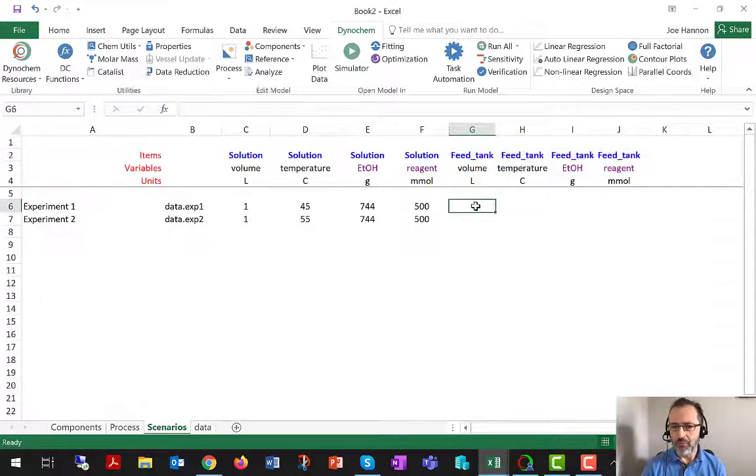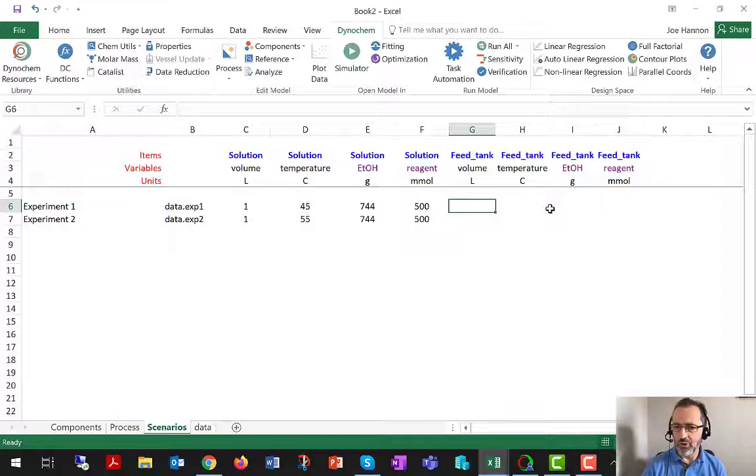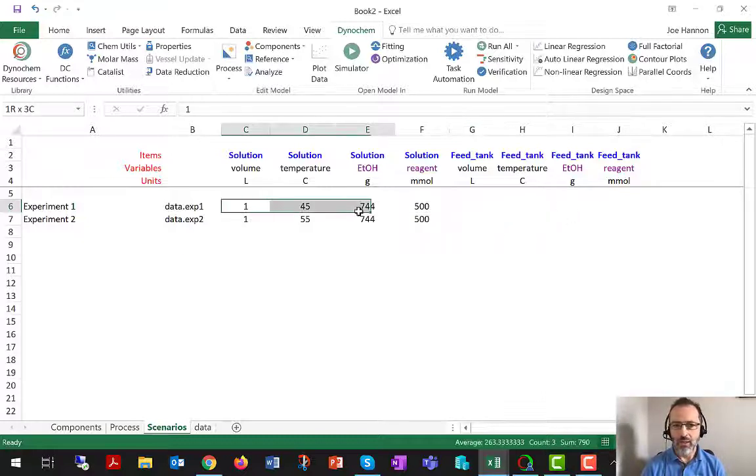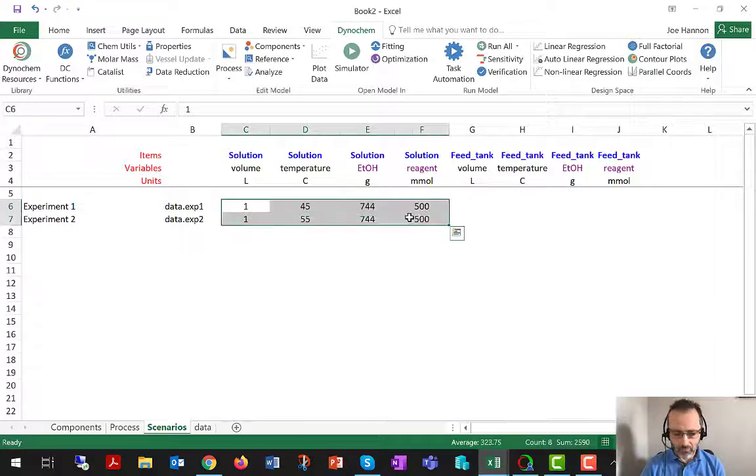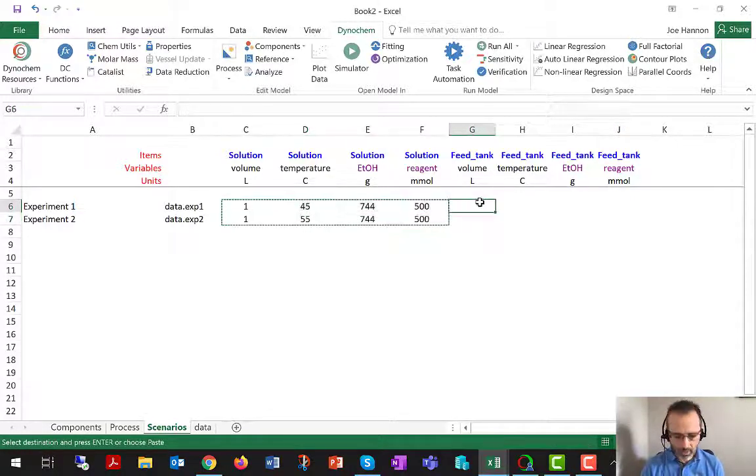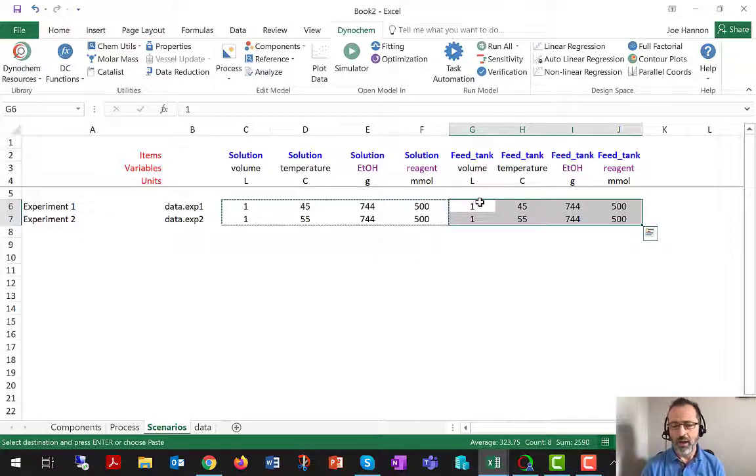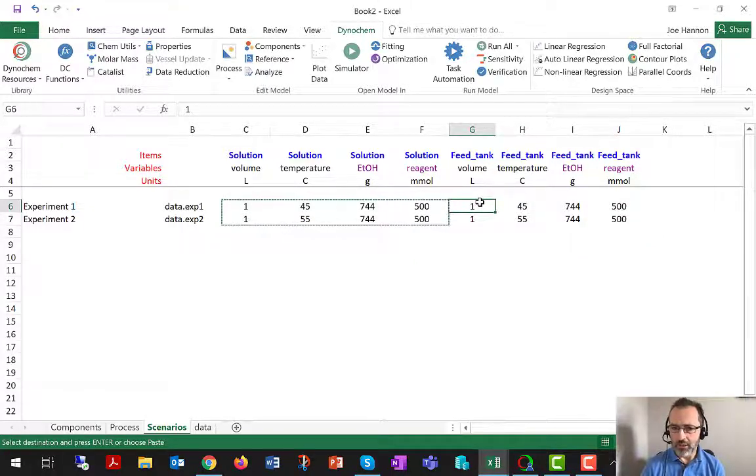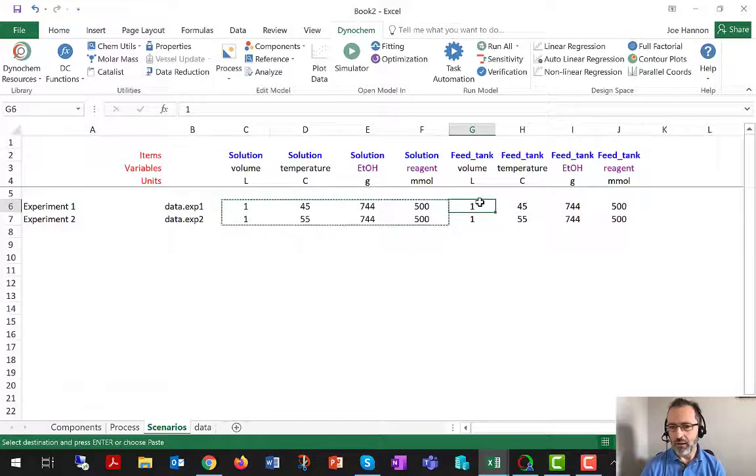I'm going to be specifying now feed tank volume, feed tank temperature, how much ethanol is in the feed tank, how much reagent is in the feed tank. And again, just for convenience right now, I'm going to assume that we have about as much material in the feed tank as we have in the main vessel.